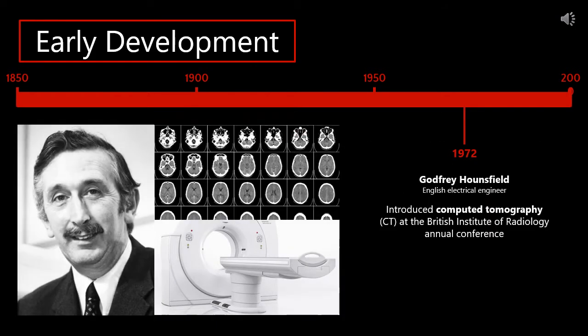Development of cathode ray tubes was made over the years, giving us high-resolution images for more conclusive results and more applications. In order for X-ray to be used for industrial purposes, higher voltages are required to produce a ray with satisfactory penetrating power, so higher vacuum tubes were developed from then.